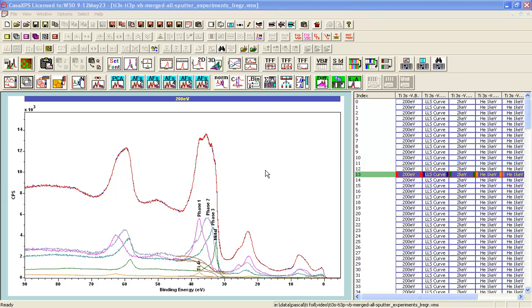The original measurements were measured against a sputter time, but each sputter time produced a different depth or a different response in the oxide, so the sputter time is not really as important in terms of looking at these 5 experiments as just simply saying these are different experiment cycles of XPS.